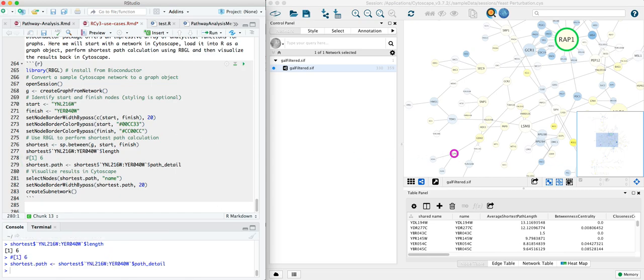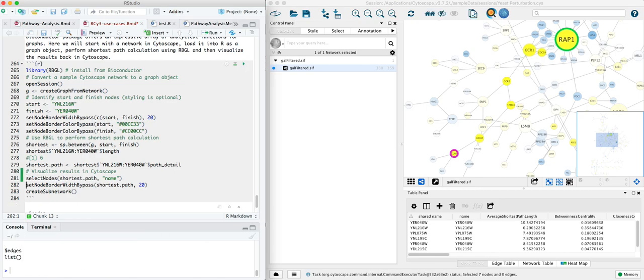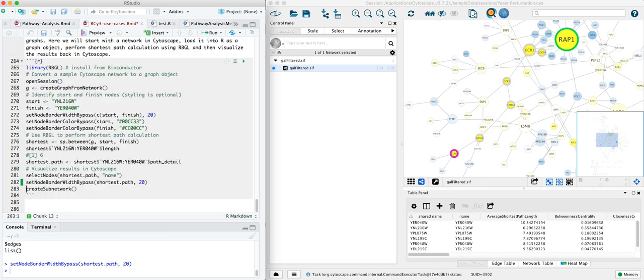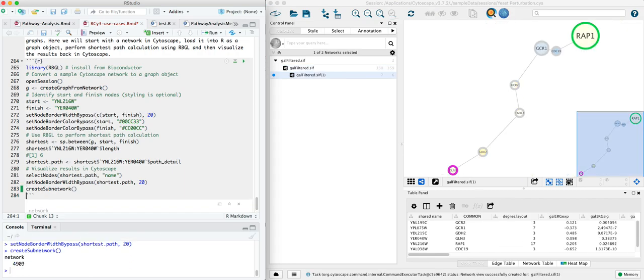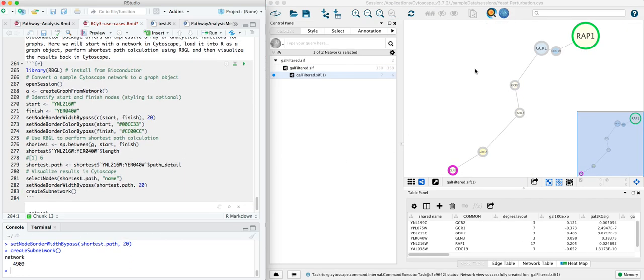Let's go ahead and select that path in Cytoscape, and we can change the node border width of each of the nodes along the way so that we can see it. We can even pull it out as a subnetwork with those three lines we just ran. So here's our shortest path between RAP1 and GLN3.